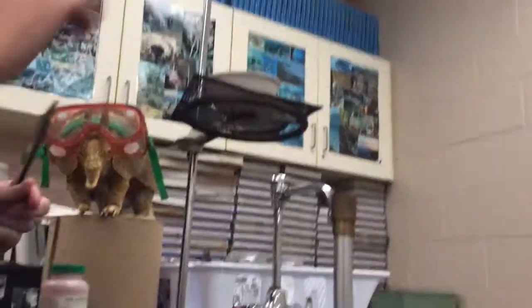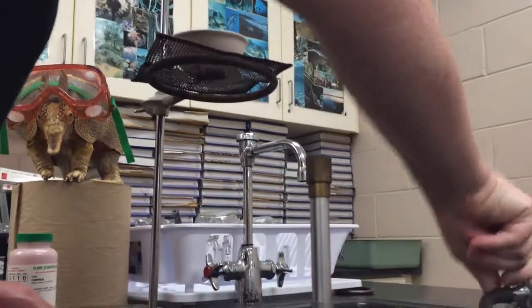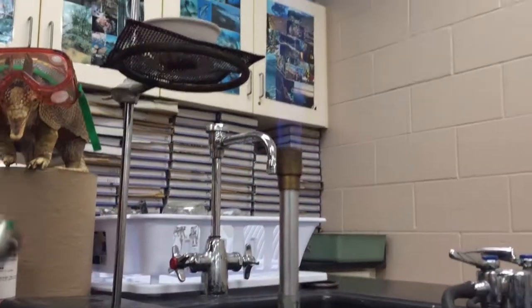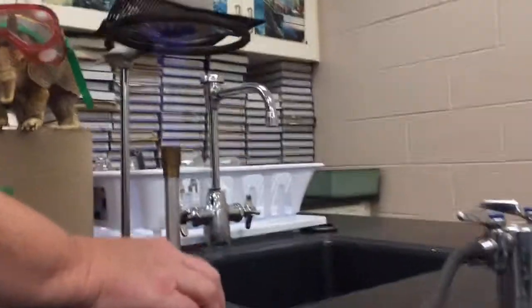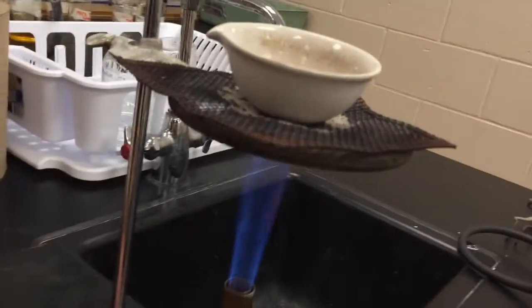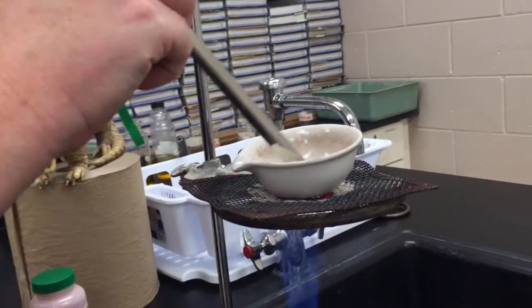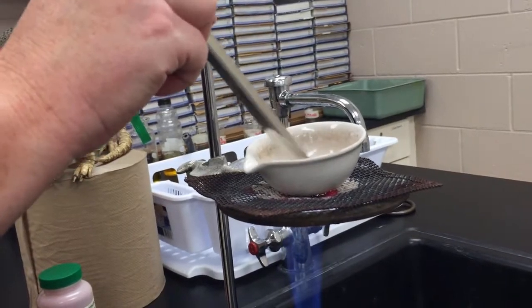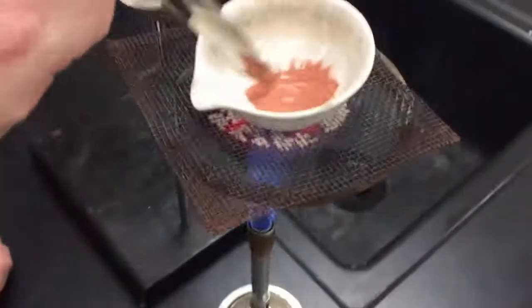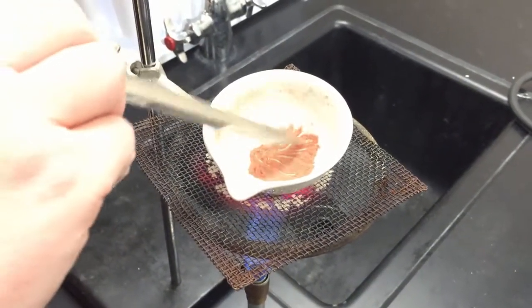So students used a piece of wire gauze and a ring stand with the ring, and ignited the Bunsen burner. Place the Bunsen burner underneath the wire gauze, and I told them to stir the powder frequently. You may be able to bring the camera up a little bit to be able to see the contents of what's inside, so you can see any changes that might be taking place.